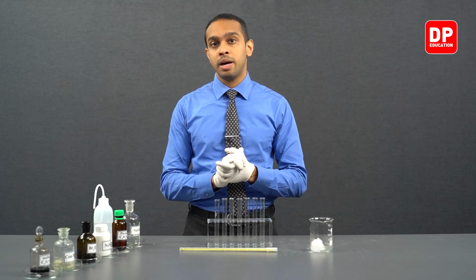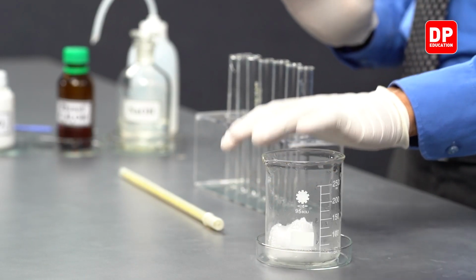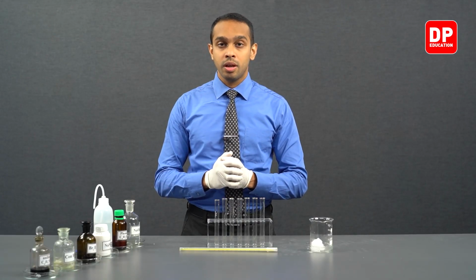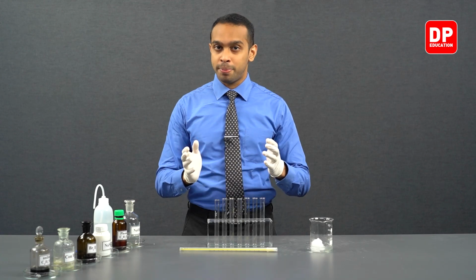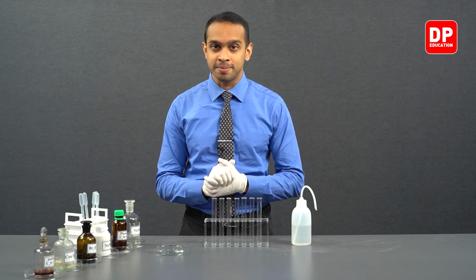We will be using an ice bath in this experiment, so we will be using ice in a beaker to cool down our solutions. Now, let's move on to the first part of our practical. In the first part, we are going to see how aniline reacts with water, bromine water, and how it reacts with HCl.